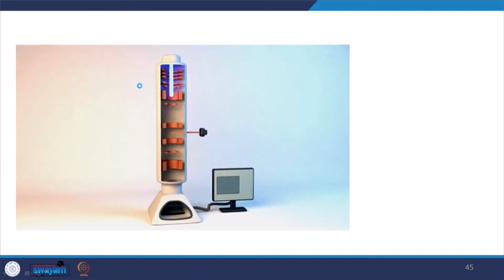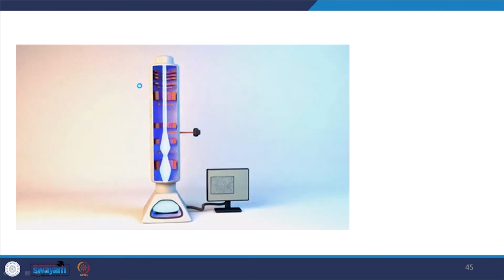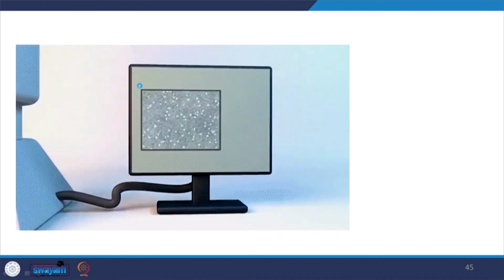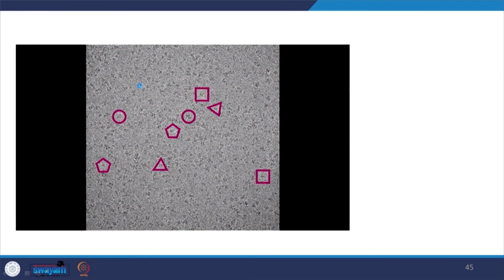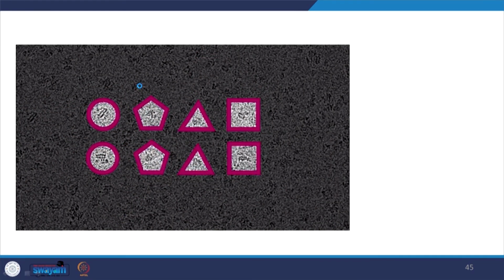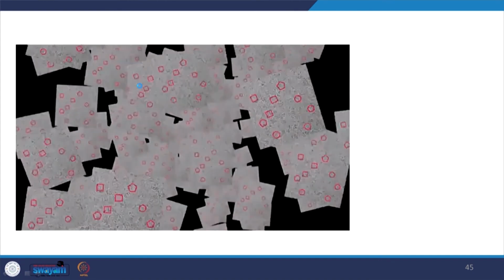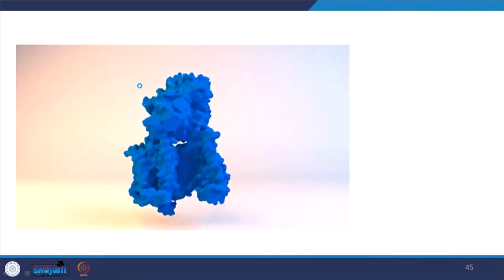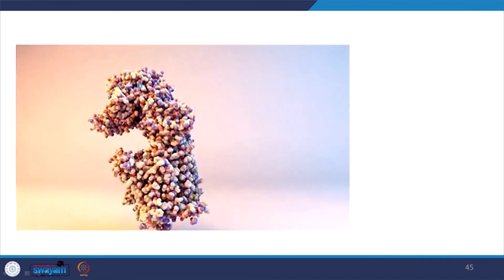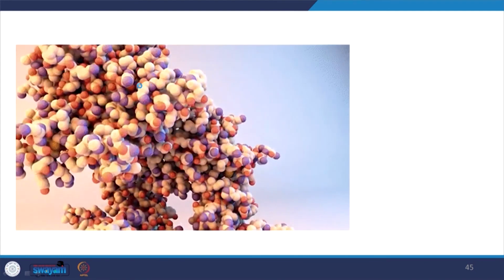This is the cryo-electron microscope, the electron is coming and hits the sample, and the data comes out oriented in different directions. The software aligns similarly oriented data into similar positions, and then all those similar data come together and your 3D model is ready. This is the 3D model you prepare for a macromolecule.